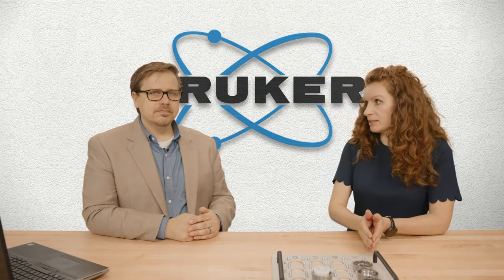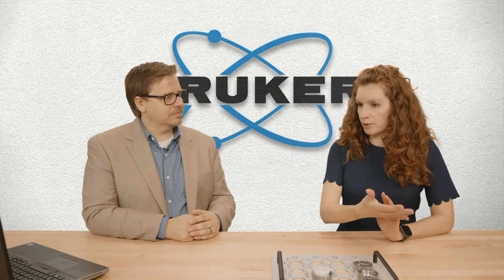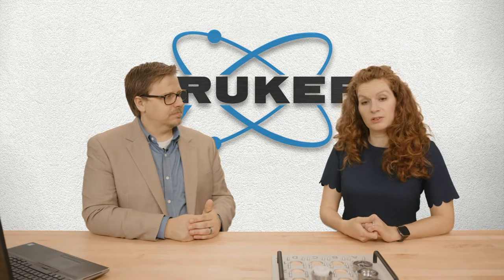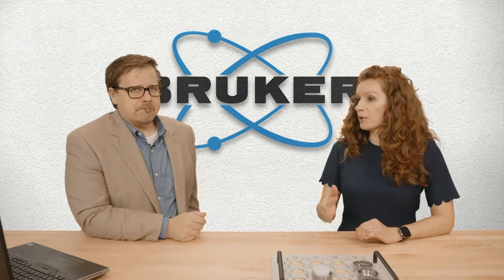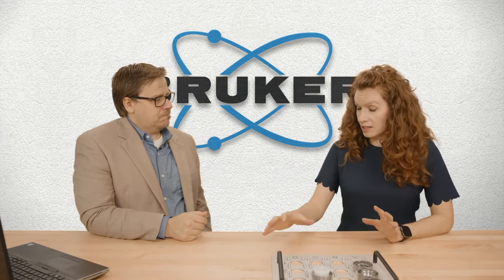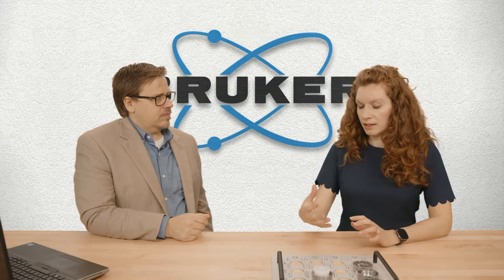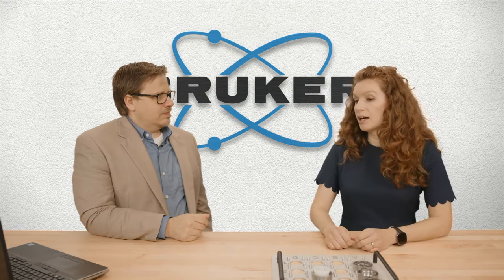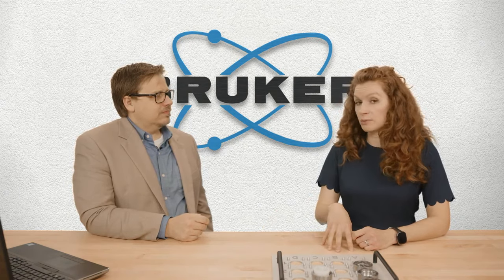And then for your pressed pellets, the same thing, right? You want to use the same preparation for the pressed pellets, for the standards, and for your unknowns. This also makes sure that you avoid errors in sample preparation if you always do kind of the same thing, right? We do have standardless calibrations, and these are made with several different standards, and obviously then we use calculations within the software to make sure that it works with all kinds of different samples. But obviously, accuracy from standardless is not as good as it is for custom calibrations.